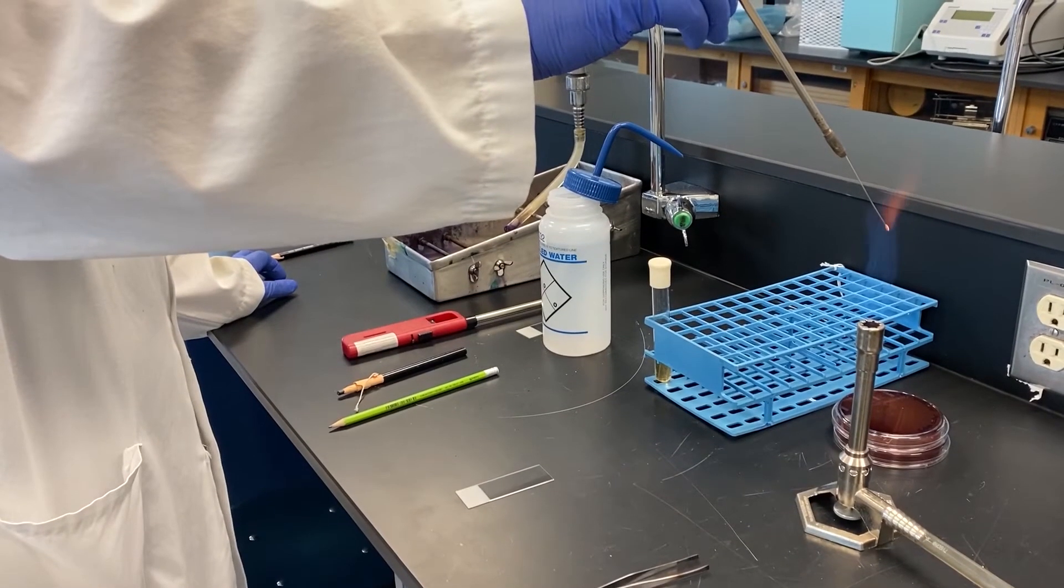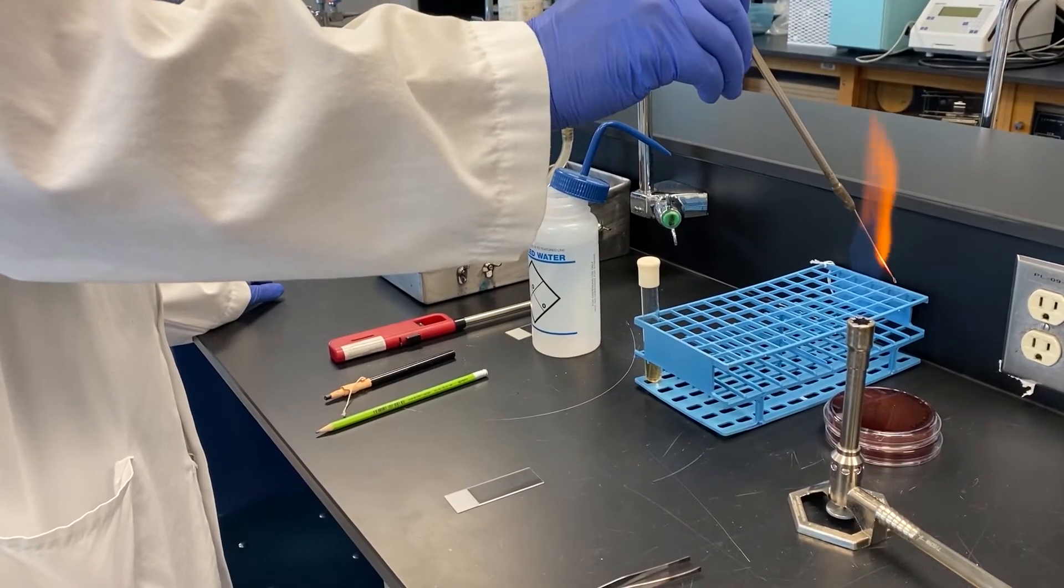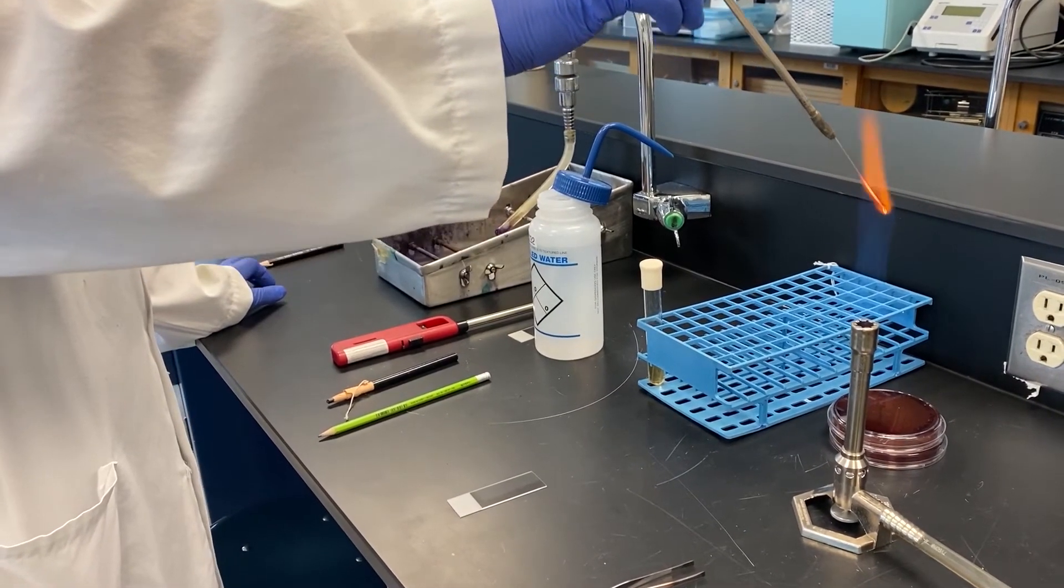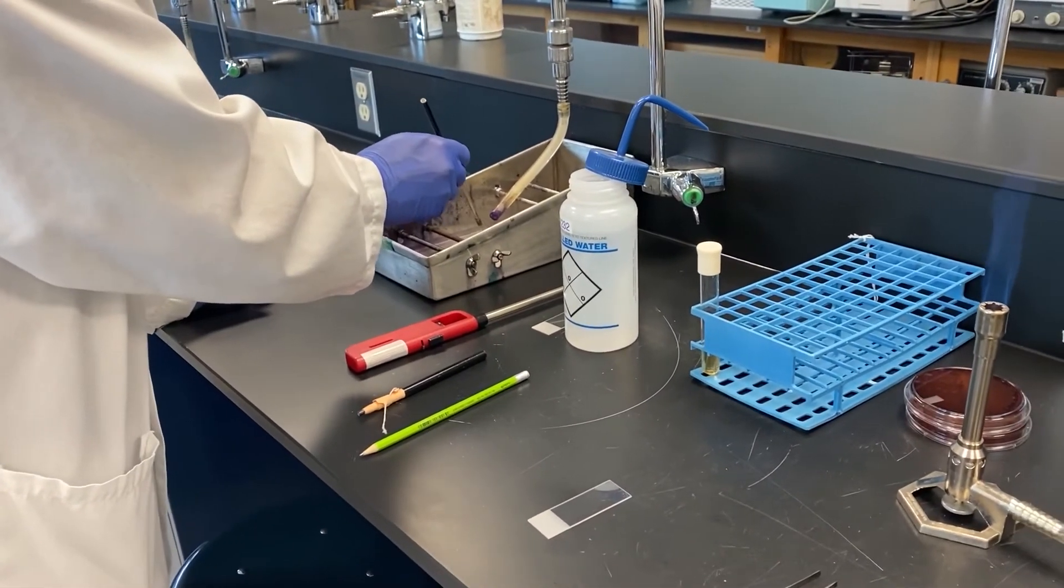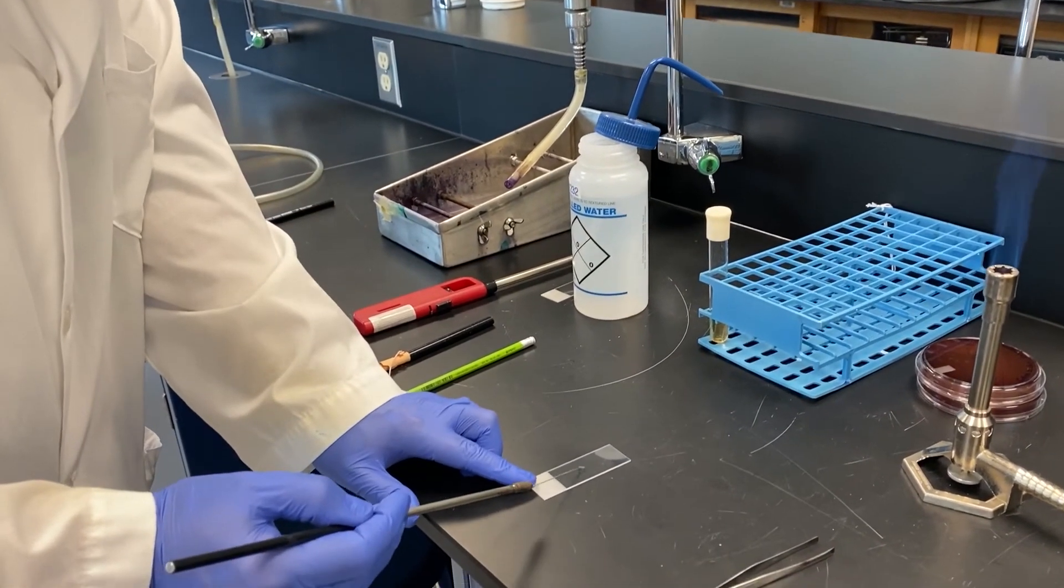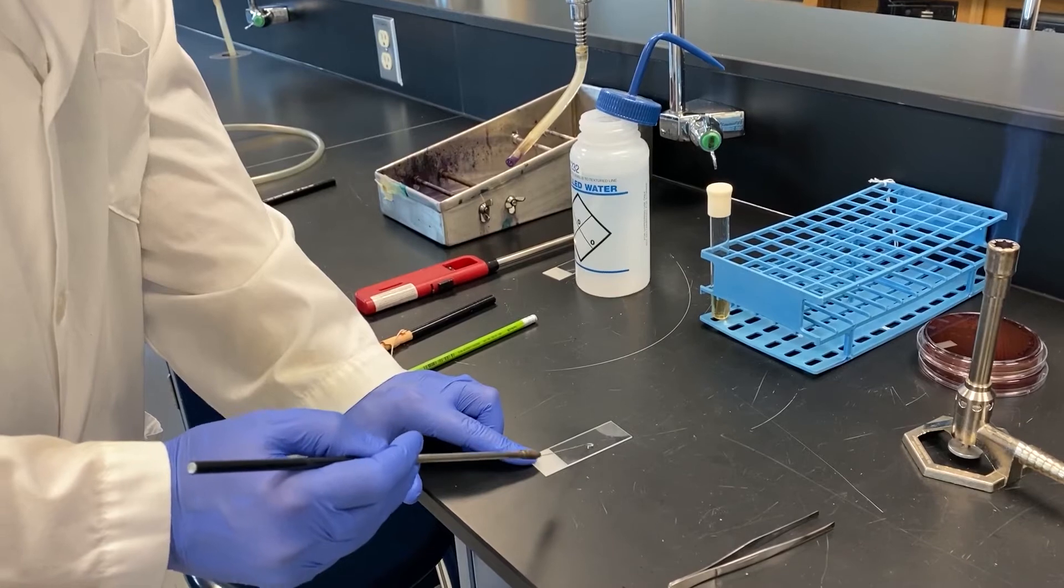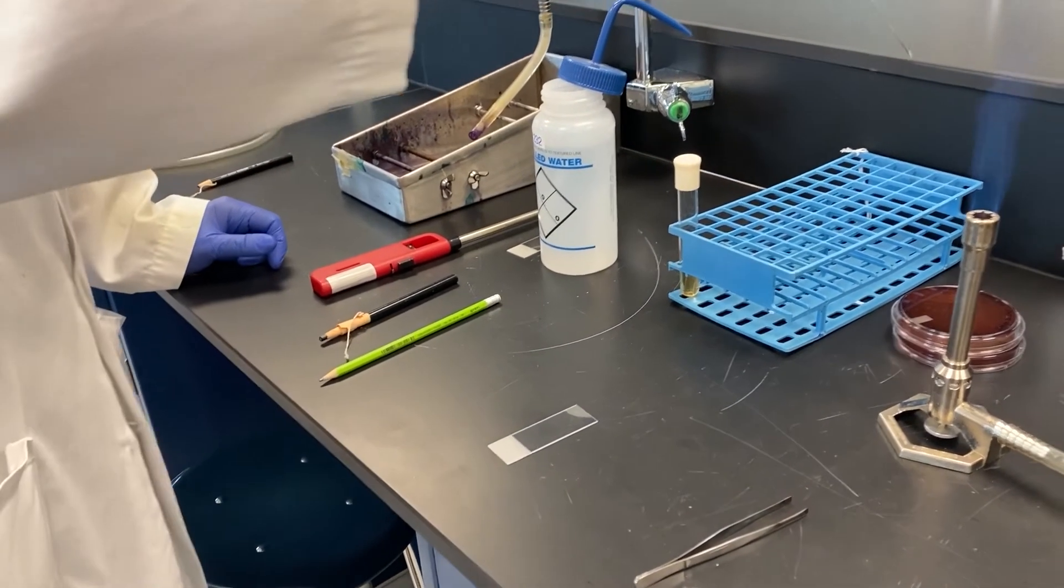First I want to show you how to prepare a slide using bacteria that have been grown on a plate. When making this type of smear you need to add a drop of water to your slide. You can do that using your loop and the flow of water from a tap as is shown here, or you can use water from a water bottle. Notice the sterilization of the loop before and after every use.